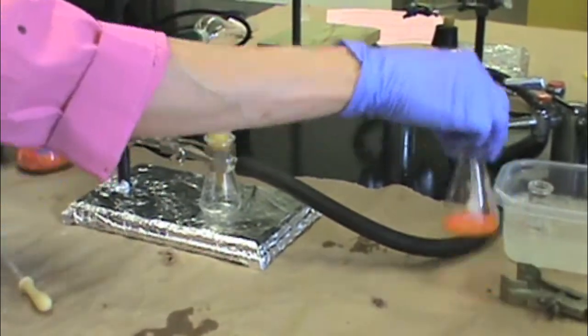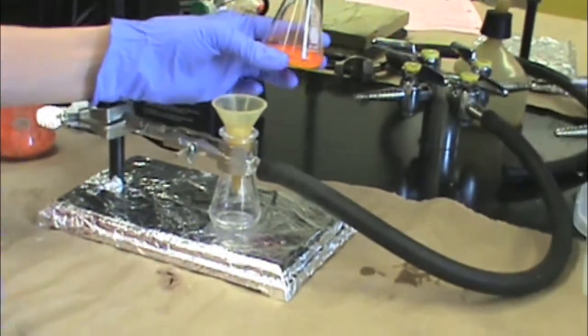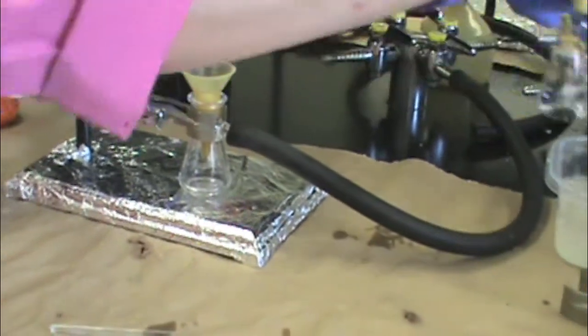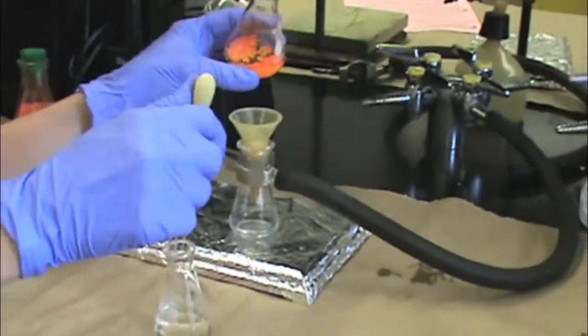Once you do this, you can take your crystals and add some of your recrystallization solvent that has been chilling using a pipette.